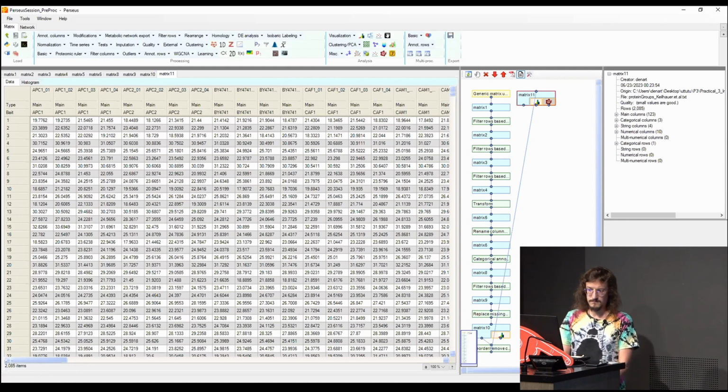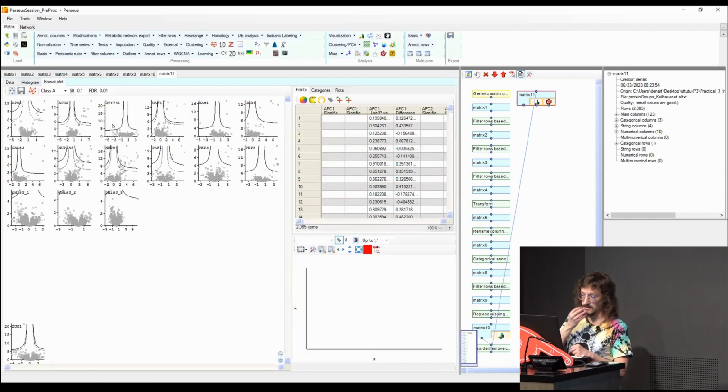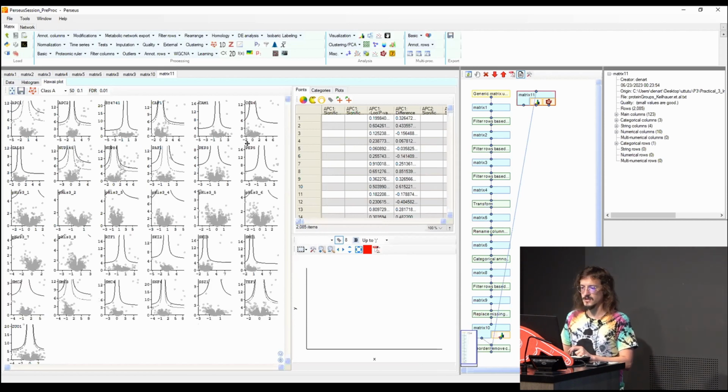Of course, if you're going to repeat something like this as an experiment, if you want to do affinity enrichment mass spectrometry, I think a good way to represent your data could be also this volcano plot, the Hawaii plot, actually, but that is nothing more than many volcano plots. But maybe you want to look for something nicer. That could be the network. And how to create a network from this information. Give a bit of time to the program to show now all the volcanoes.